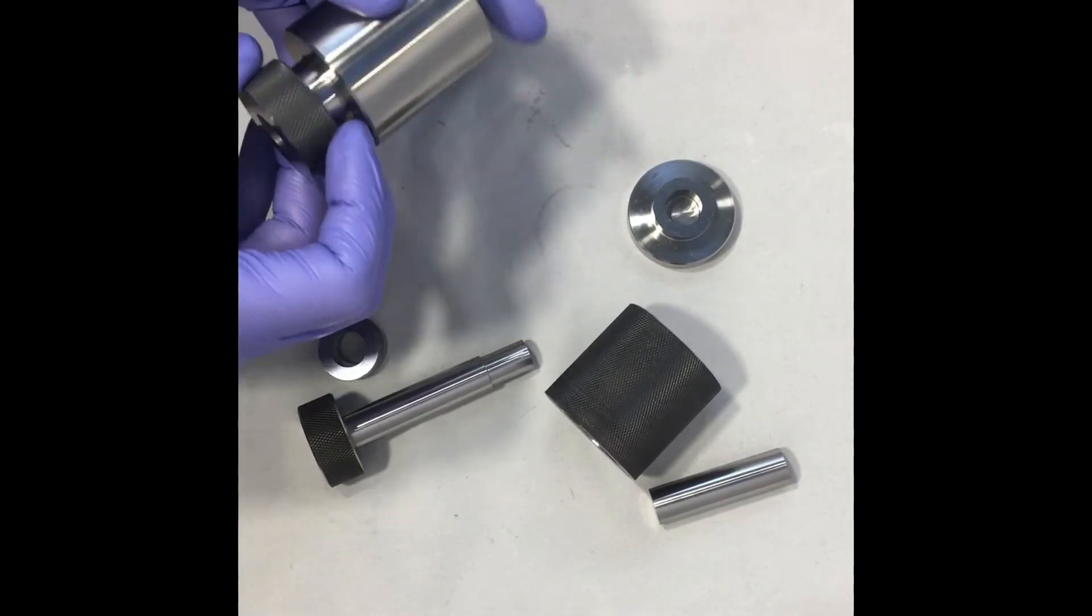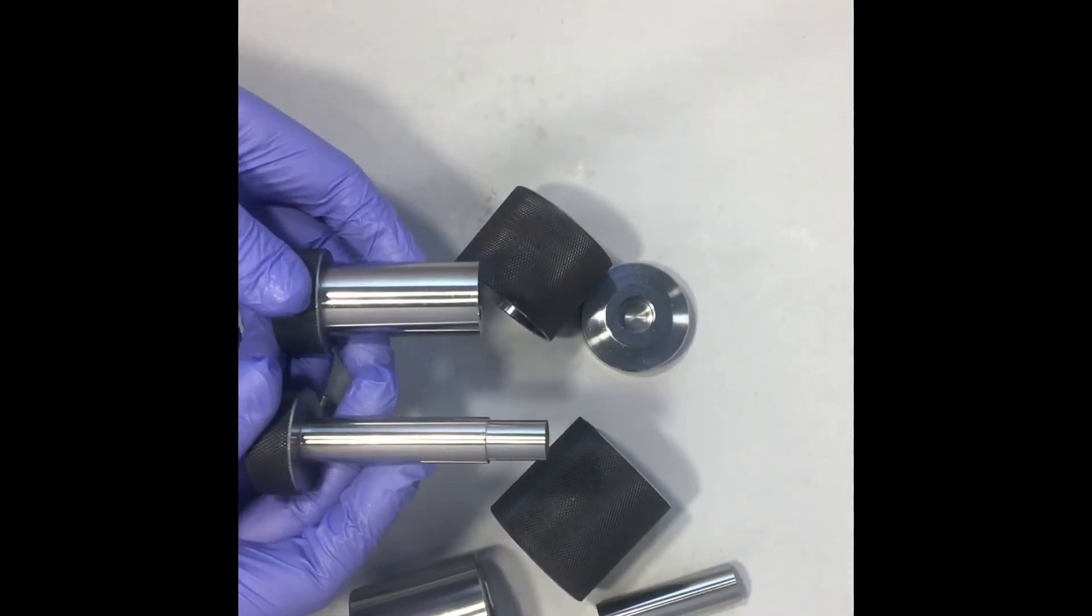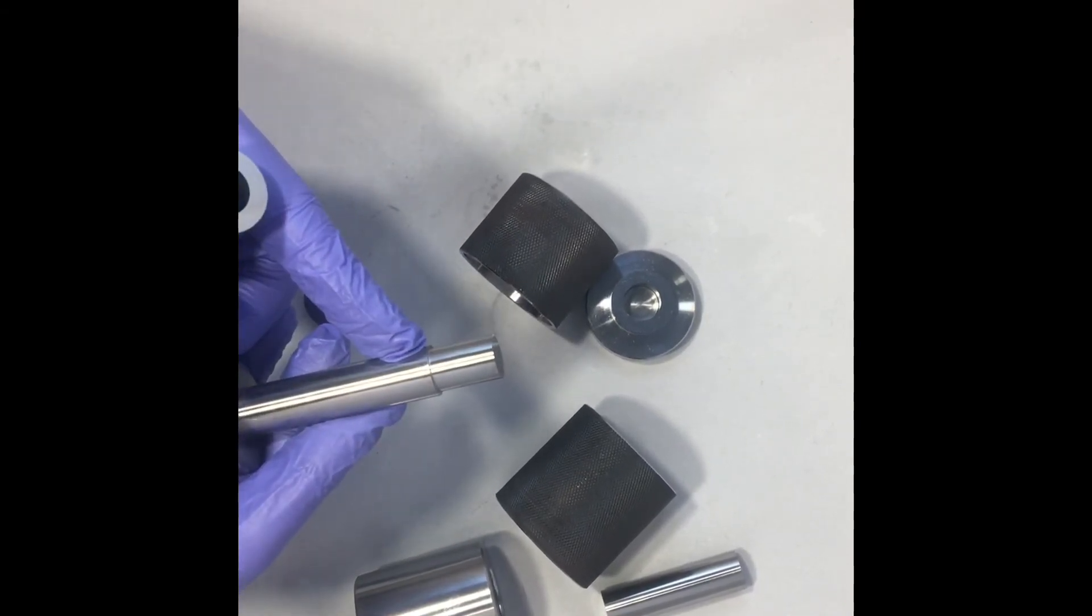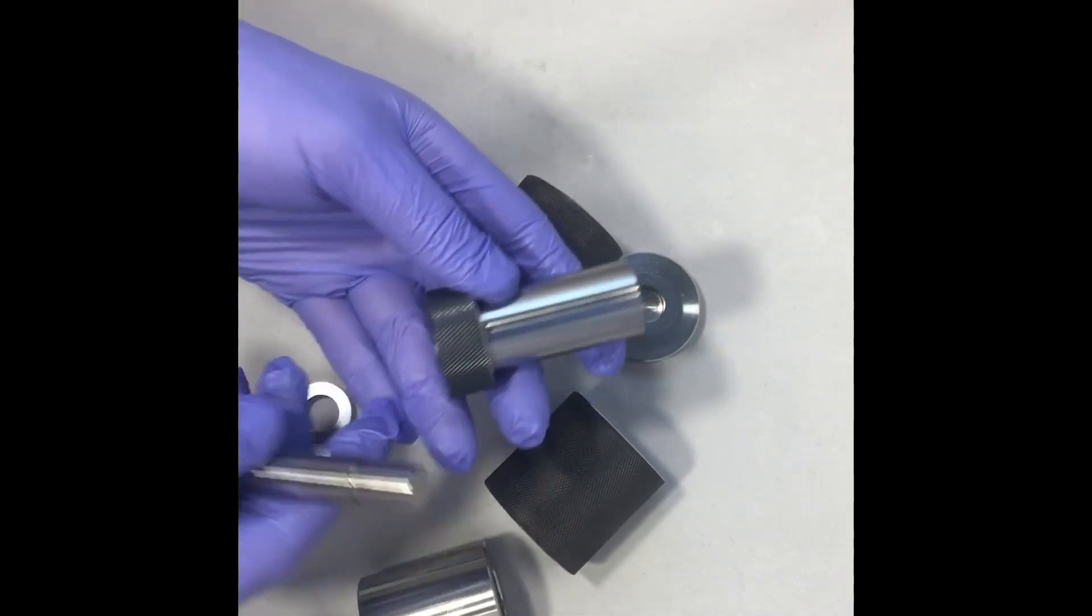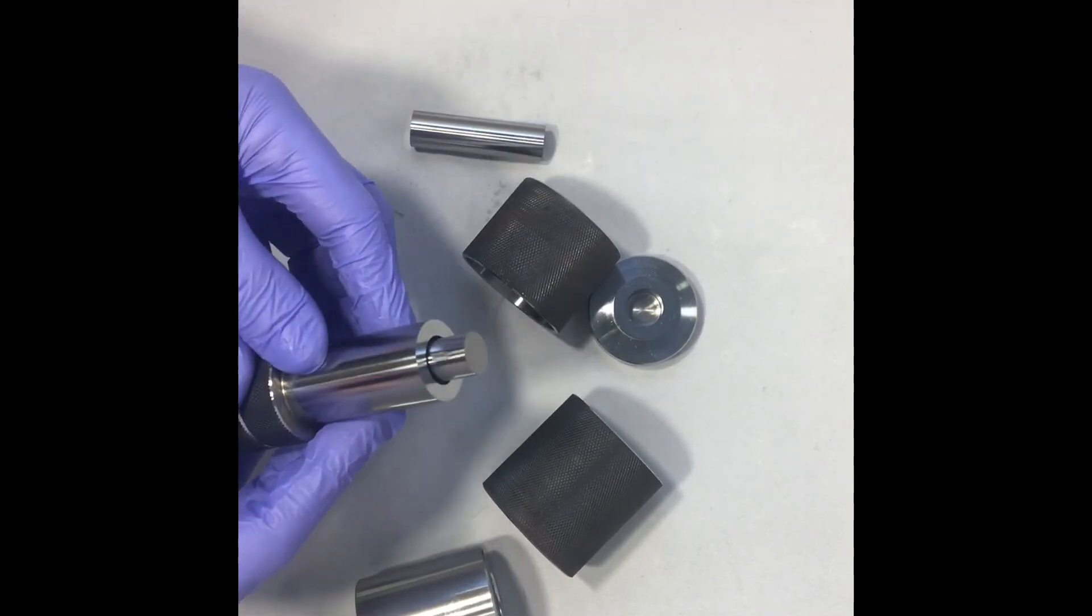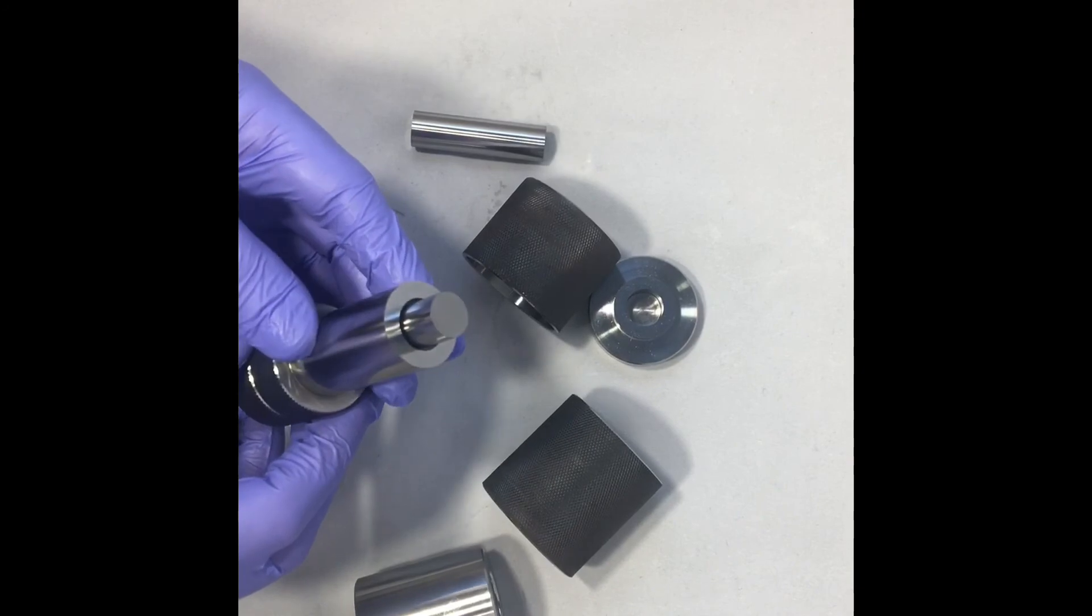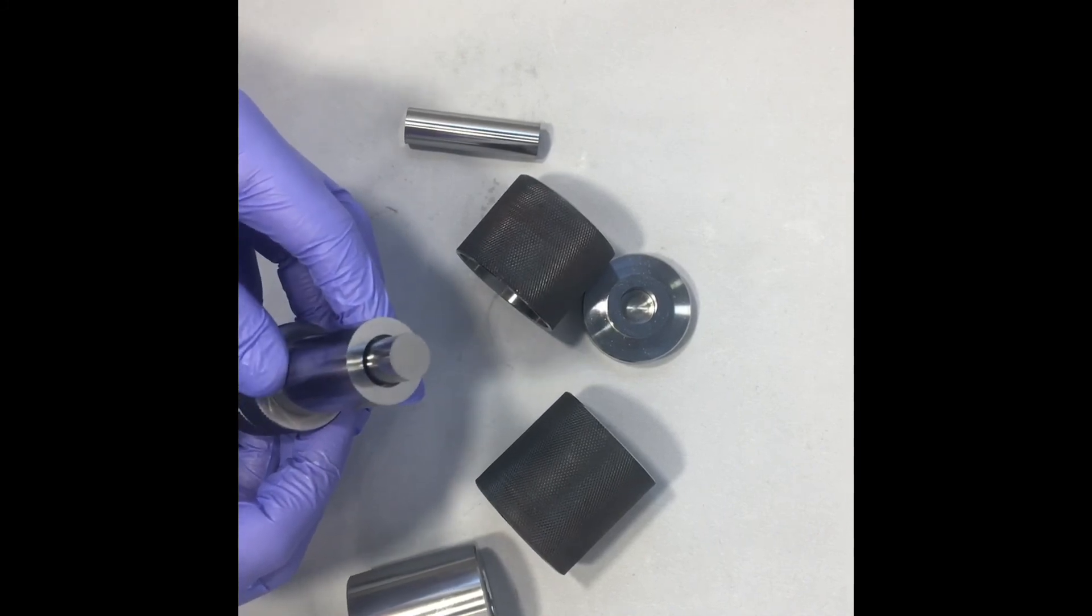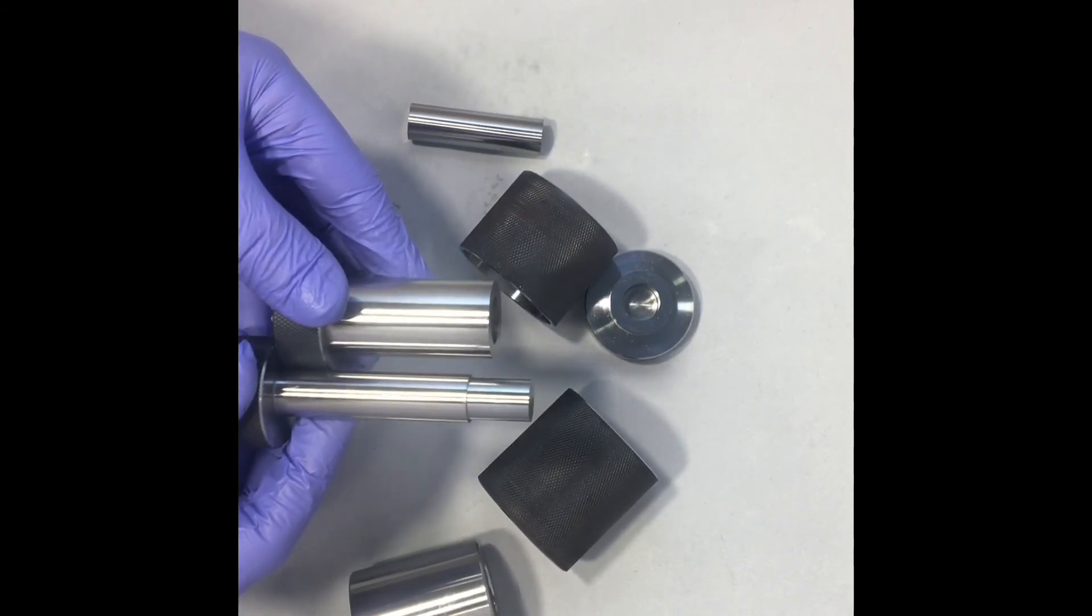So that's the annular die set from Pellet Press Die Sets. I hope this gave you a little bit of an idea of how it all fits together. The reason why the pin ejector has this step height on it is because when you're releasing your central pin, you want to get rid of it without damaging the inside of your ring pellet that you've just made. So what that step height does is it creates a very small gap between the moving part there and your freshly pressed pellet so you don't have any of that interaction and it doesn't damage it. That's one of the features of this die set.